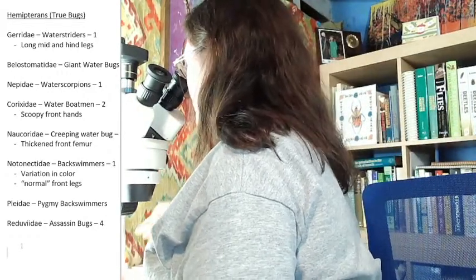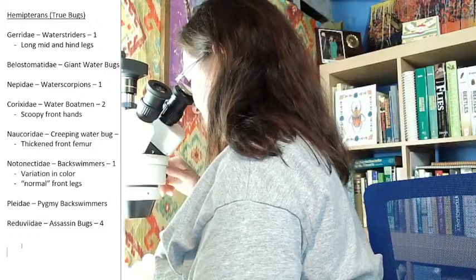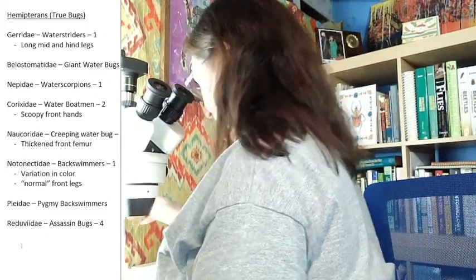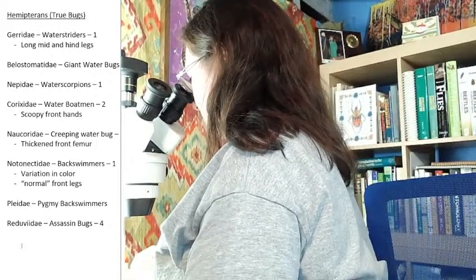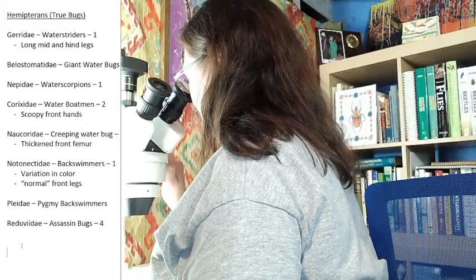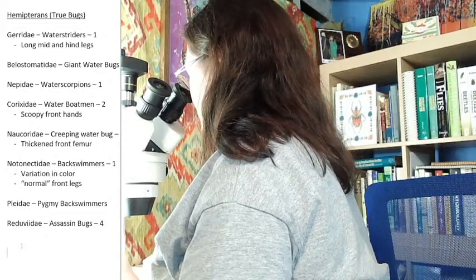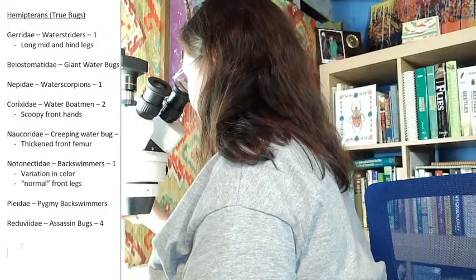Let me get this focus prepped for you guys. Don't want to make anyone dizzy. Now, this mirid died with its wings open a little bit, so that angle is not as pronounced. Oh, there it is. I'll flip it over. It's pronounced on the other side.